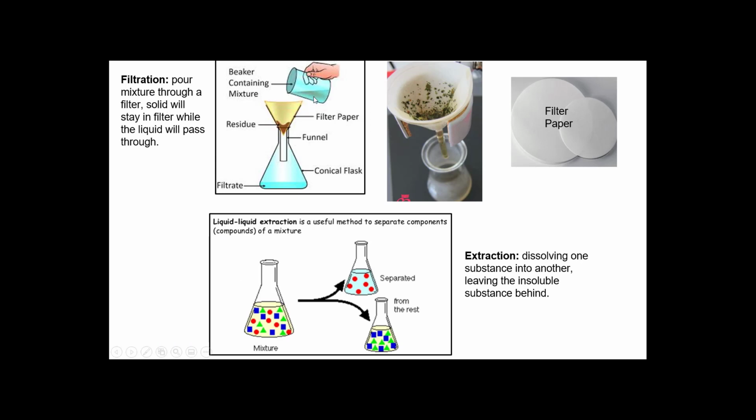So you have a mixture here that's a solid and a liquid. You will pour that completely into this funnel, so you don't want to leave anything in this beaker. And the solid will get stuck at the top, so it'll be filtered out. And the liquid will pass into the bottom container. And we use filter types, and there's different sizes. They're not paper, but they're kind of, I don't know how to explain them. They don't fall apart easily.